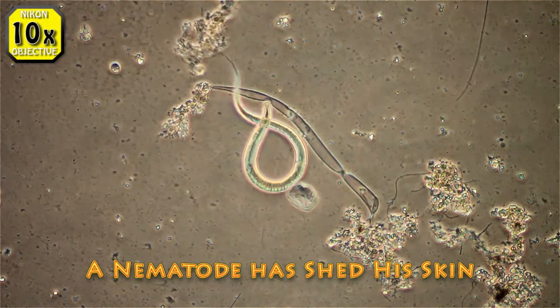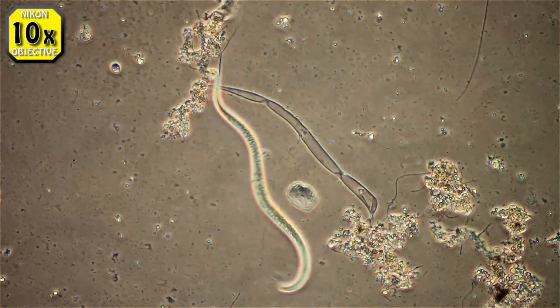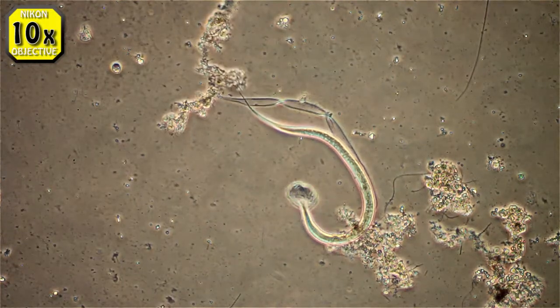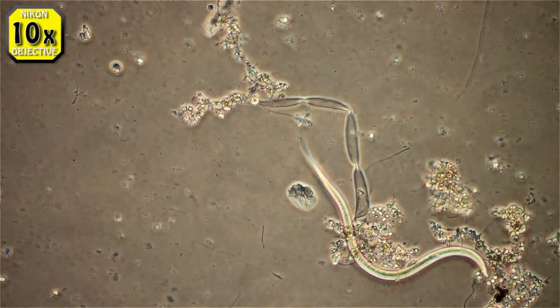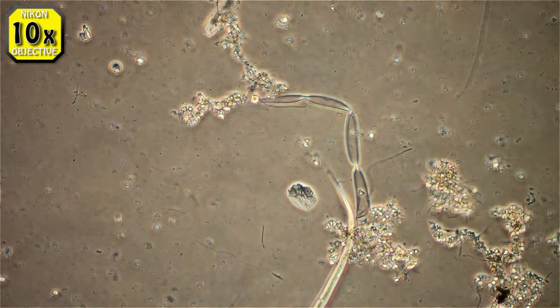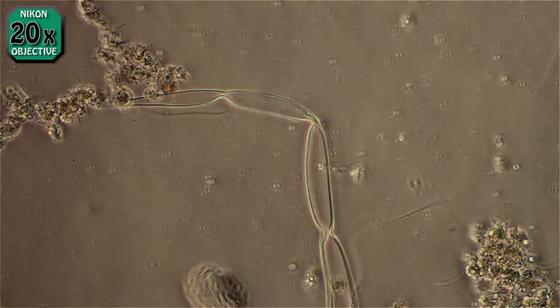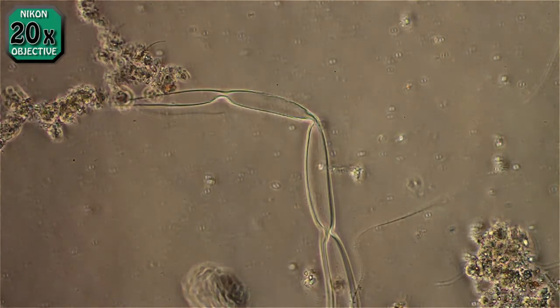This is a nematode — I don't know exactly what subspecies, but it's a nematode. That thing that looks like a sausage skin beside it is a nematode skin, possibly from this very one. I didn't actually see it getting out of it, but since it's so close, this is probably its skin. I have read that they shed up to four times in their life, so no telling how many times this has been shed.